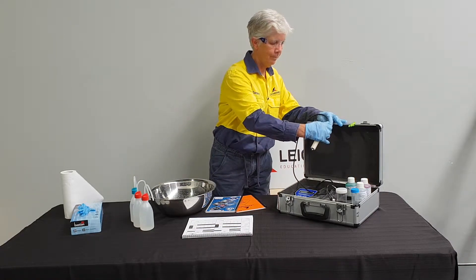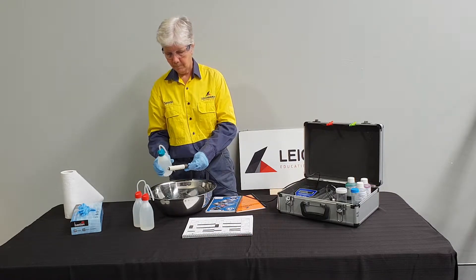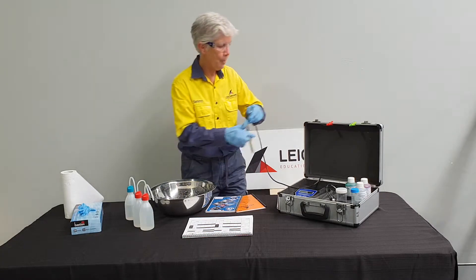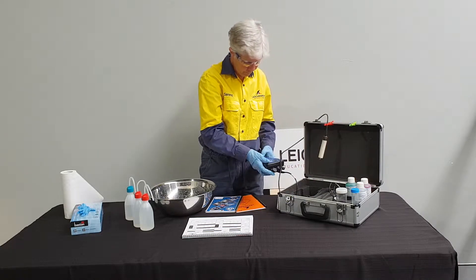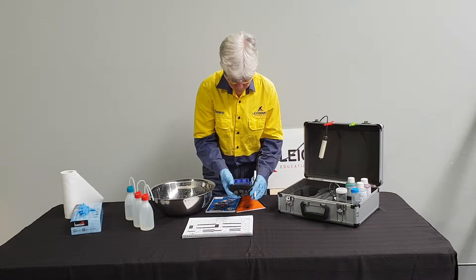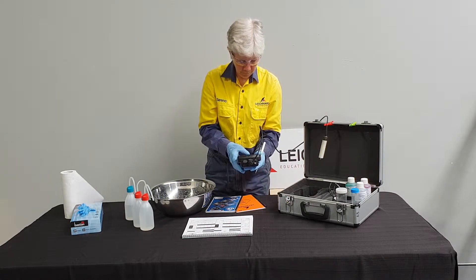The calibration for conductivity is a two-point process starting with zero calibration. Serena triple rinses the probe, shakes off any excess water, and hangs it back on the case. Zero calibration is completed in air, so Serena records the pre-calibration values in the record sheet. Serena then follows the process as set out in the operating manual and completes the paperwork.